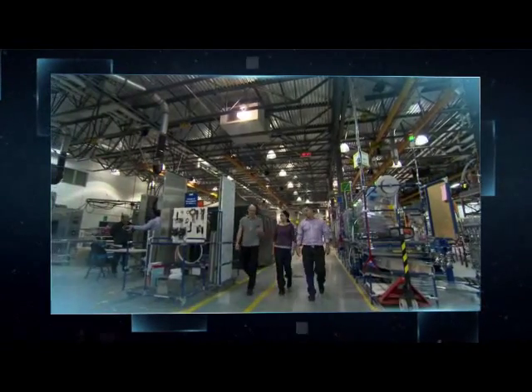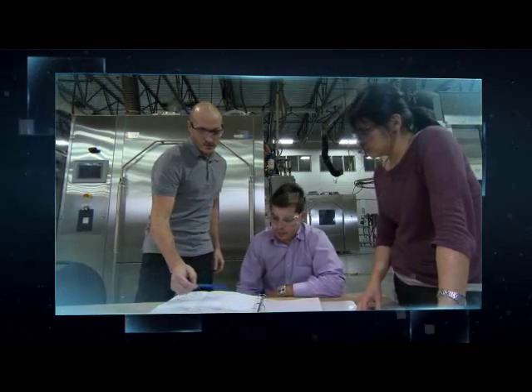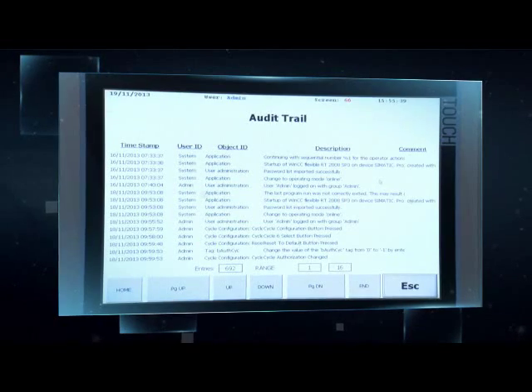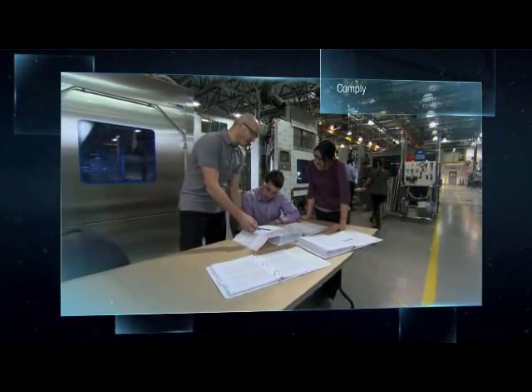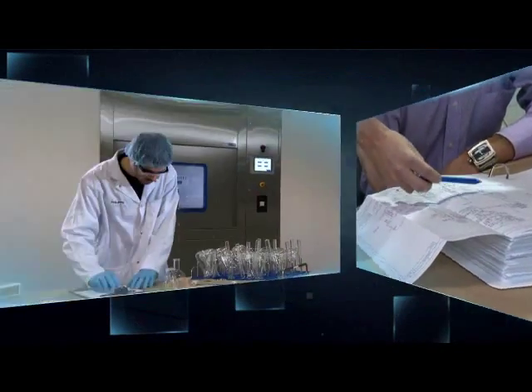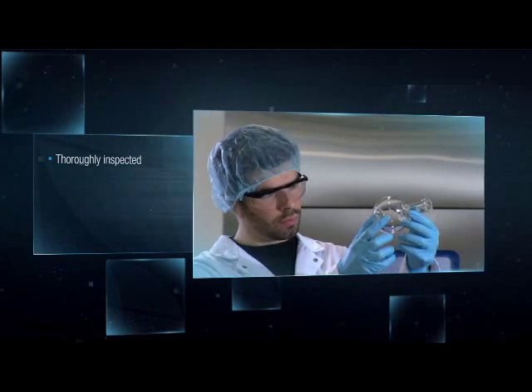Complete design, manufacturing and qualification documentation can be provided to facilitate and accelerate on-site qualifications. The electronic data security options allow users to configure a comprehensive yet cost-effective system to manage vital electronic data and comply with FDA 21 CFR Part 11 and European Annex 11 requirements.